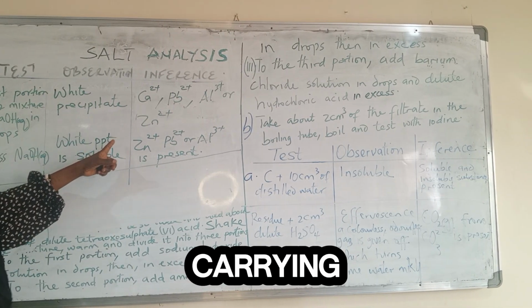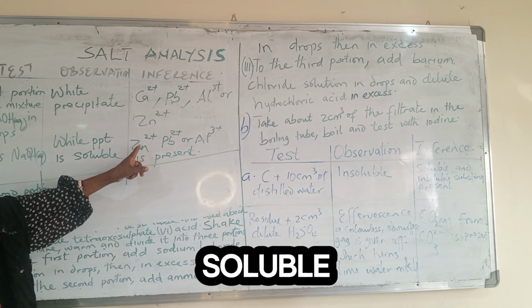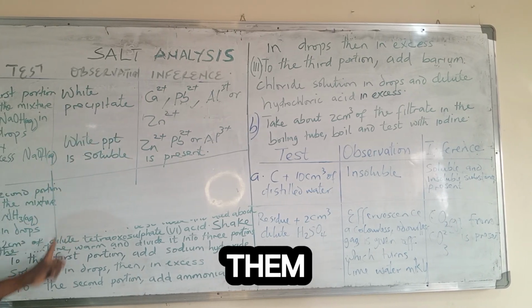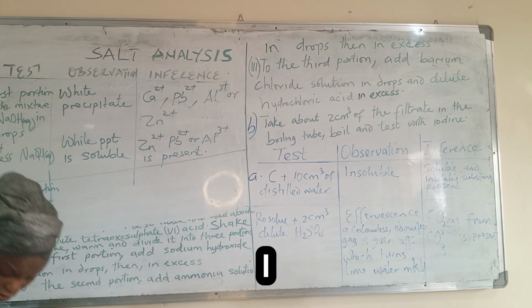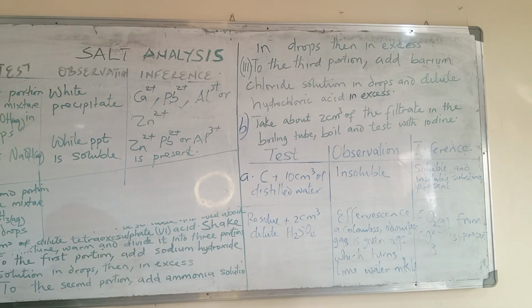Look at the way we are carrying the salt together. If it is soluble, we have zinc salt.